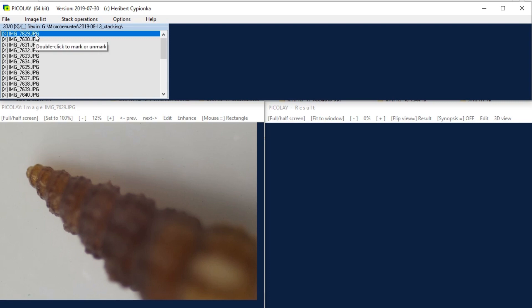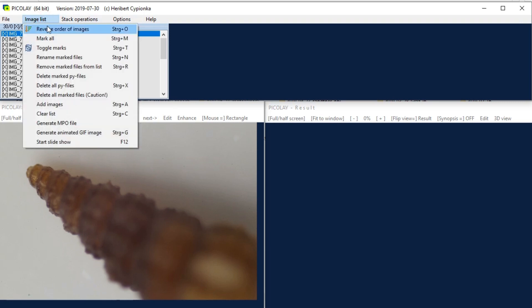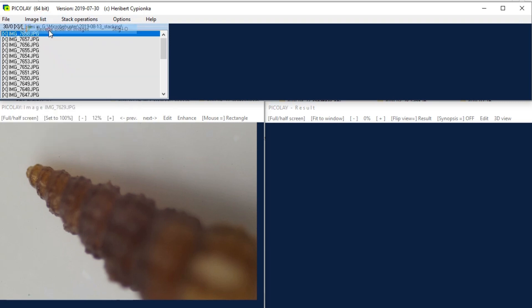So I have to reverse them and the program is able to do that by going to the menu image list and then reverse order of images because the top image should be the one that is in focus at the very top of the specimen and then by clicking on it you can again control and check the images.